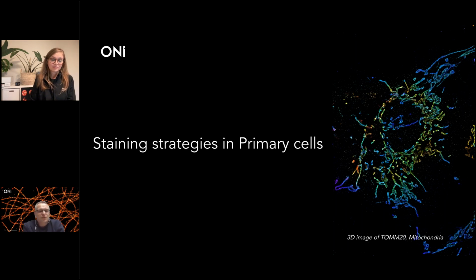Yeah, this is a very interesting question. We can say we use cell lines, and we are studying immune cells. I would say every immunology lab will have T cells, Jurkat cells, in their incubator. So you can use these cell lines, but these are immortalized cell lines. We need to understand that the results from primary cells can vary from your cell lines, especially if you consider a CD4 cell. Jurkats are CD4 T cells, which should be considered helper T cells, but they are also used for killing assays.